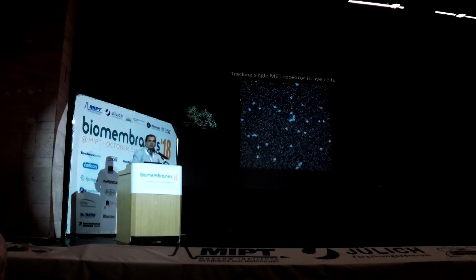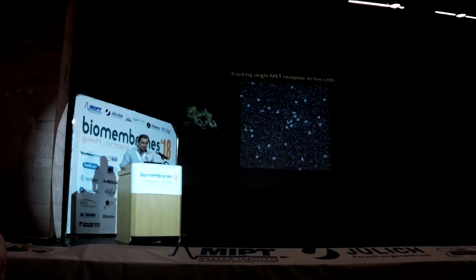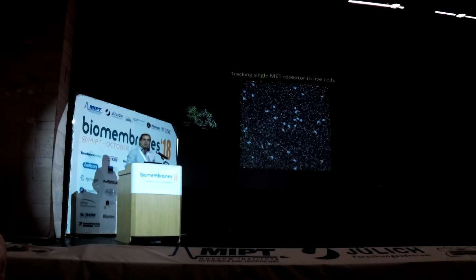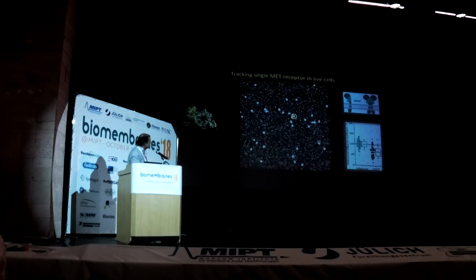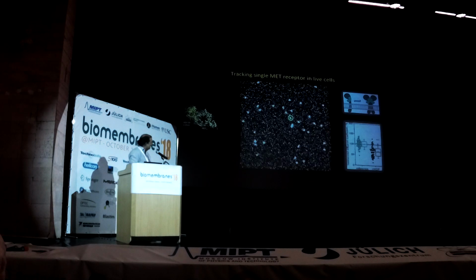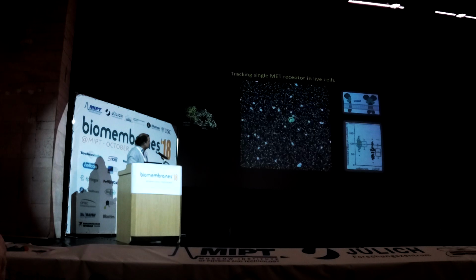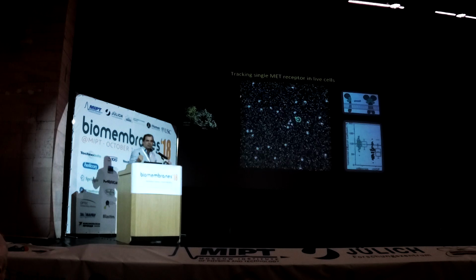So we see the mobility of this receptor. And this is great data. I like this a lot. And well, to see a little bit more in this movie, we need some help for our eyes. So what I did is that I colored one of those MET receptors a green circle whenever it's a single receptor, and when it found a partner, the circle turns red, and we have a co-locomotion of this receptor as a dimer. And then they dissociate again.